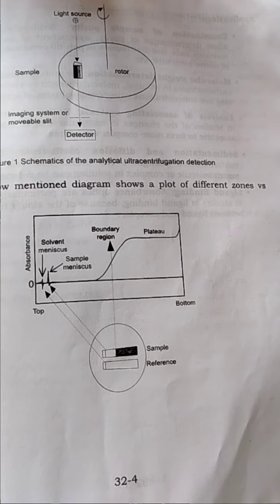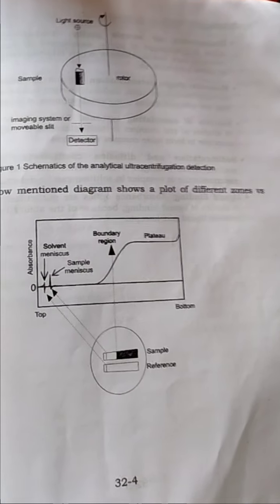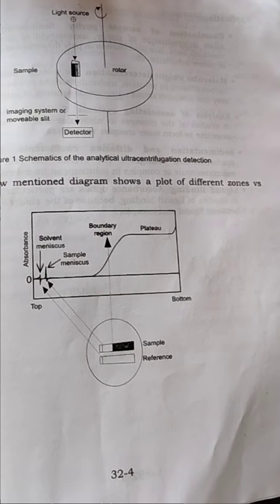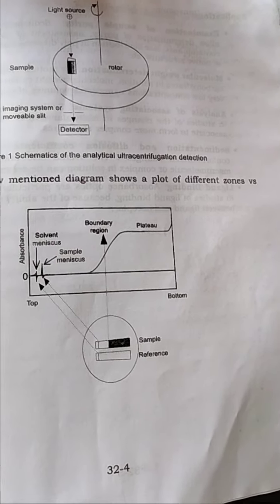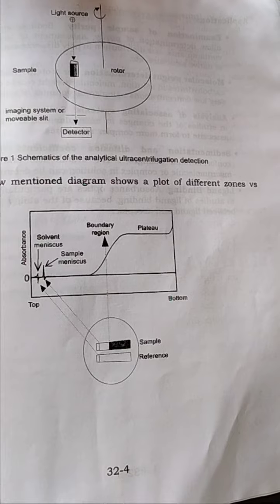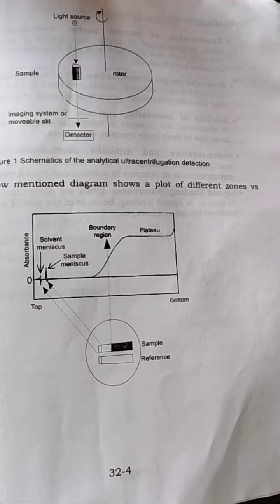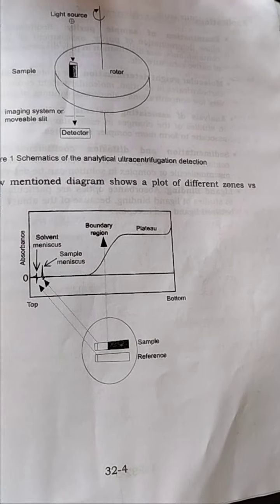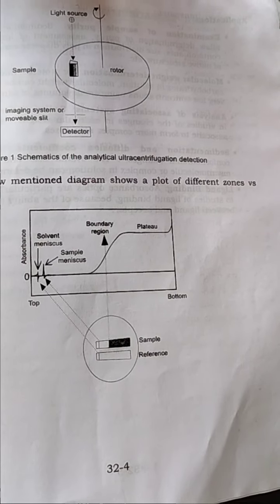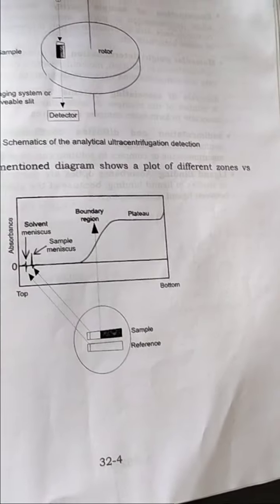The cell holds a sample volume between transparent windows, used to pass UV-visible light for detection based on the property of the compounds. For example, aromatic amino acids absorb at a wavelength of 280 nanometers, and the peptide backbone at 230 nanometers. Based on the compound, detection can also use a laser interferometer based on refractive index difference.